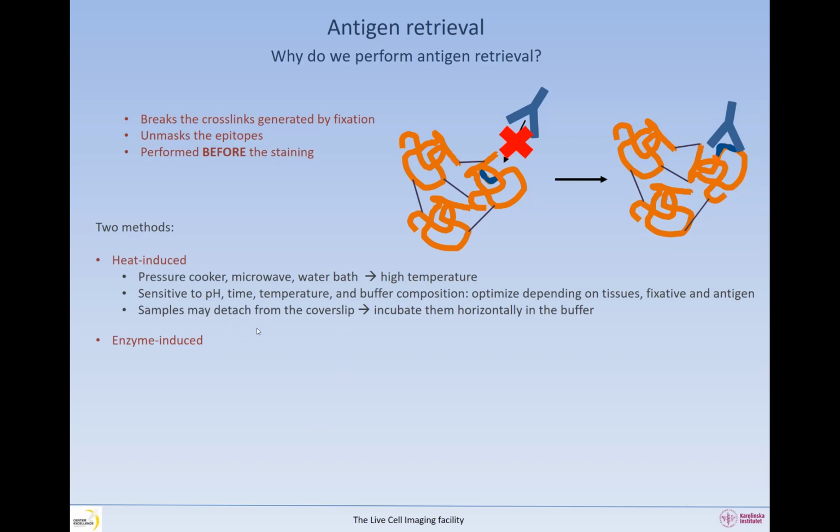And here, as I mentioned before, you might have a problem that your tissue will detach from the coverslip. If you managed to put it there and you want to try this, I suggest that you incubate the slides horizontally in the buffer, and then hopefully they will not slide down.